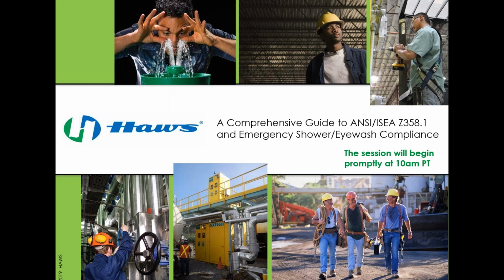This is a comprehensive guide to ANSI/ISEA Z358.1-2014 and emergency shower and eyewash compliance. Today I'm going to cover a lot of information. I'm going to be sure to cover the standard, and also how to test for the standard.